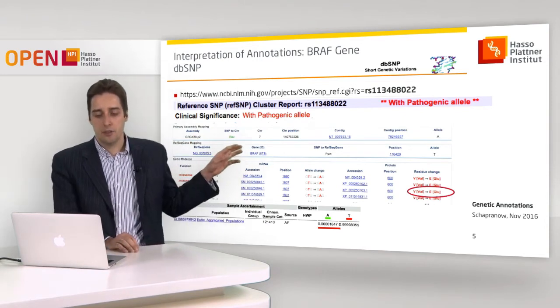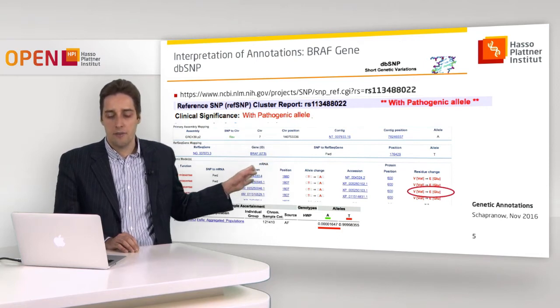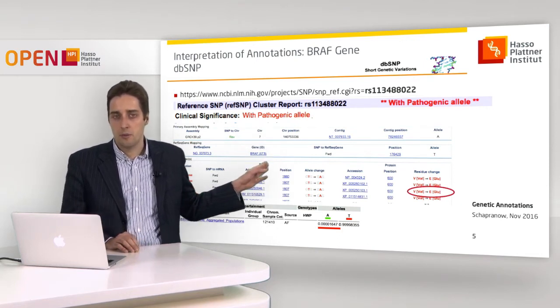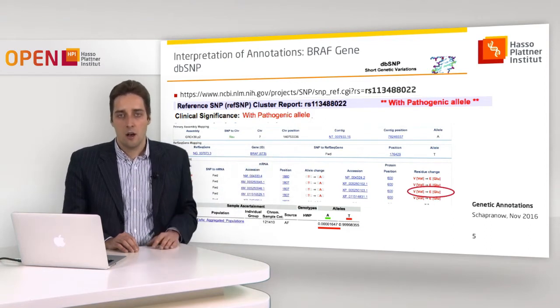Again, a little bit deeper, you see something like this information here. This gives you the understanding. On the left-hand side, you see the kind of mutation, for instance. We see the T2A change. This is exactly what we also found in our variant calling.